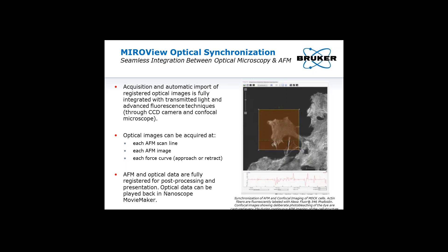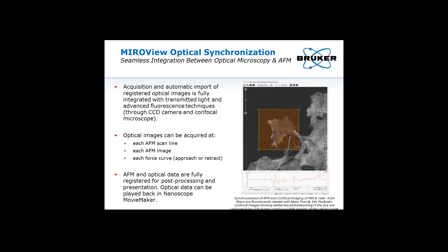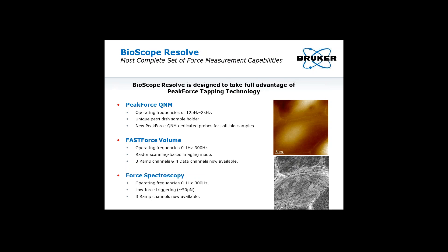As an example of Resolve synchronization capabilities, here is a video showing synchronization of AFM and confocal imaging of MDCK cells. The cell cytoskeleton is fluorescently labeled with Alexa-Fluor 546 phalloidin and confocal images are acquired every 25 seconds during the AFM image. Each time a confocal image is captured, it's automatically imported into the AFM software. Each confocal image is fully registered and does not interfere with collection of the AFM image. We can also see changes in the confocal images, including a fading of the fluorescent dye due to deliberate photobleaching.